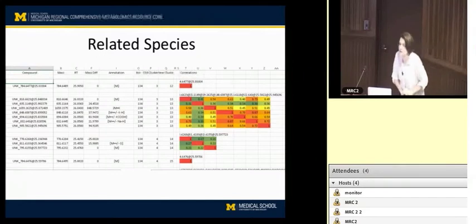Yes. Can you use the microphone or speak loudly, one of the two? So maybe I missed the point. So let's say I have one control and one sample, and we run everything on that LC mass spec and pass through the algorithm and pass all the criteria. Then it generates a table in Excel form. Now I want to see where the difference between two sets are and what mass. What can you do with that algorithm? I just want to see the difference between two sets.